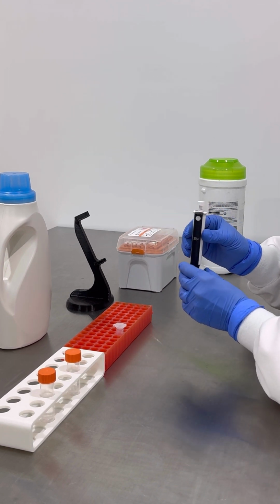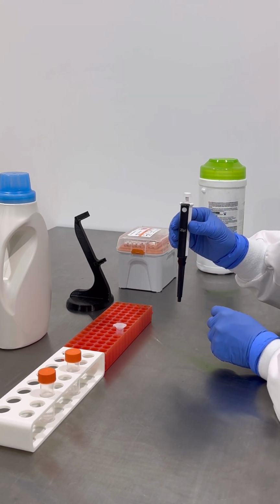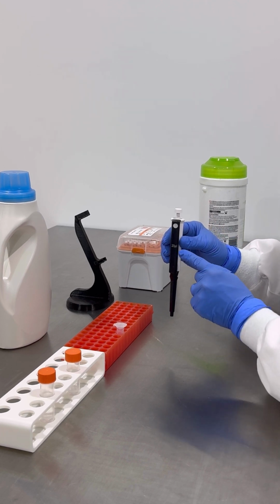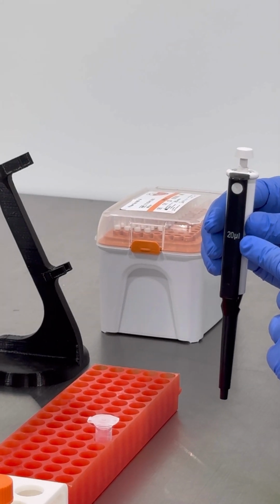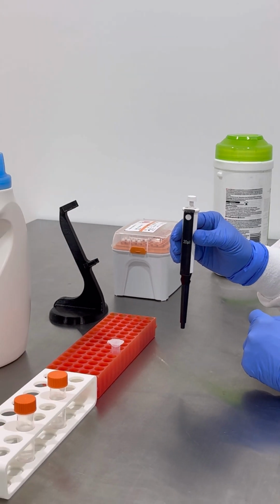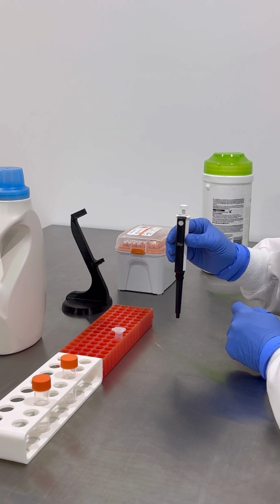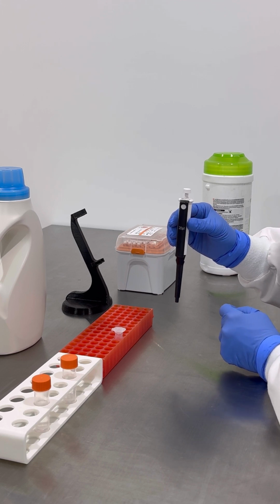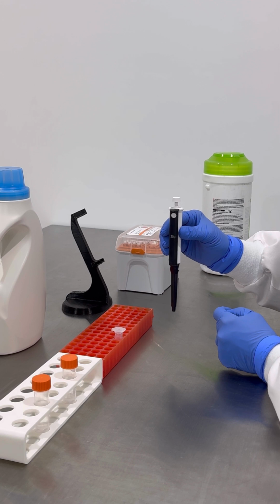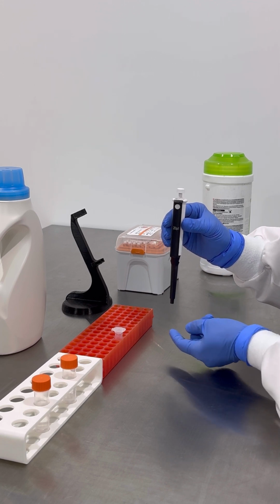Micropipettes, with a tip on the end, can measure very small volumes of liquid accurately. This micropipette measures 20 microliters of liquid, that is, 1/50th of a mil. It is important to take care of the micropipette to ensure that it continues to measure accurately and to avoid cross-contamination. Micropipettes should always be in an upright position to ensure that liquid does not accidentally enter the micropipette shaft.